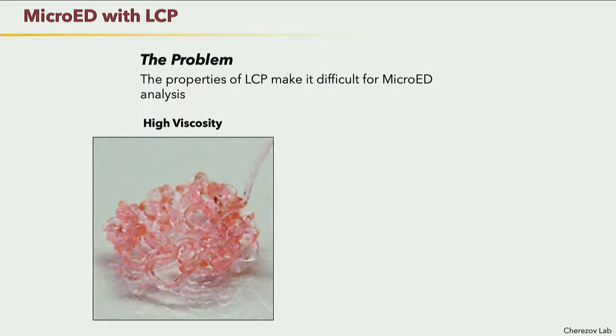Well, LCP has the consistency of toothpaste. If you squirt it, it just squirts straight up. So that doesn't work for EM very well because you can't blot it away. You can't get it thin enough to actually see through it.